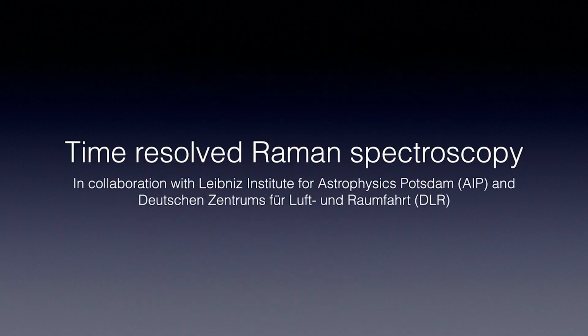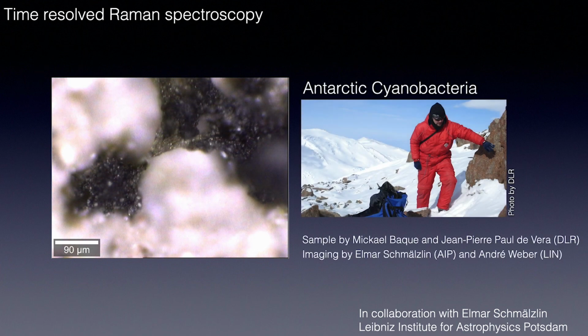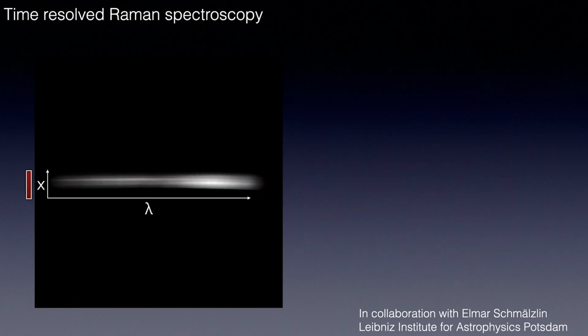Another fascinating application is time-resolved Raman spectroscopy. On this photo you can see a slice of stone covered in cyanobacteria. These black areas are photosynthetic cyanobacteria brought from Antarctica. Using a narrow slit, we directed the light into a spectrometer. Thus, we get a position and corresponding wavelength spectra.